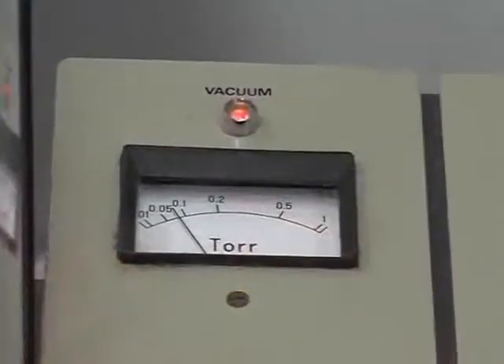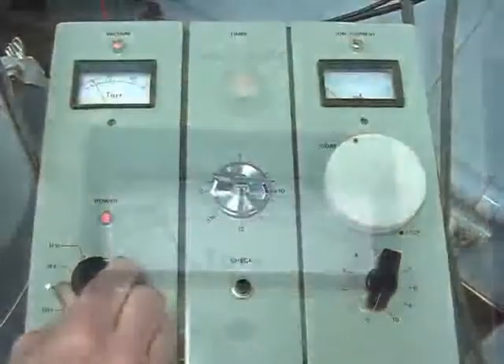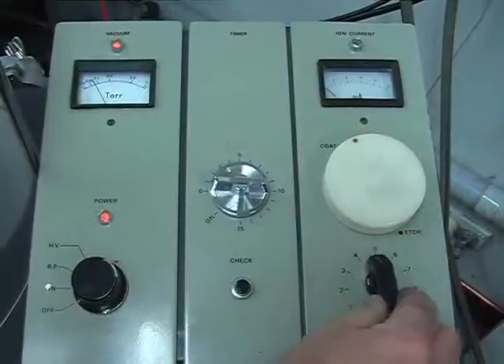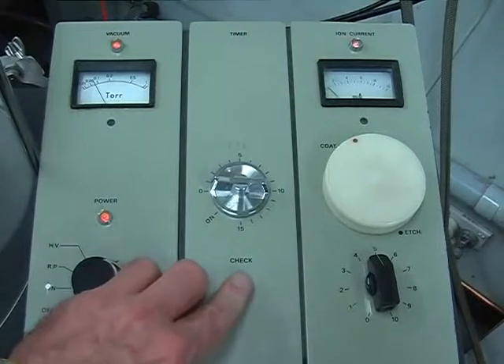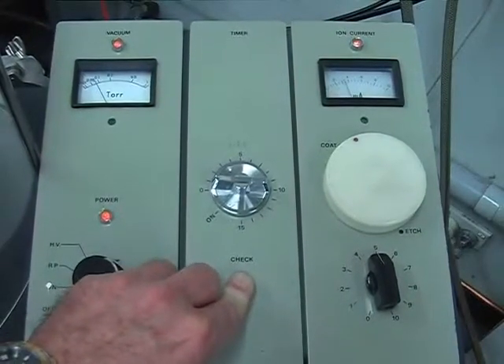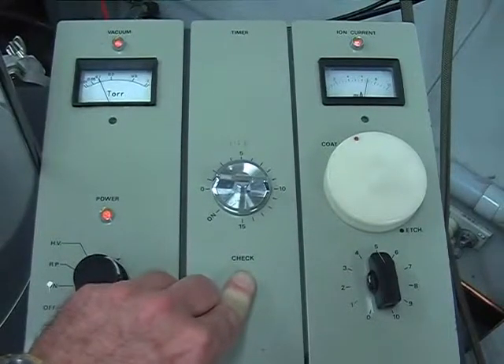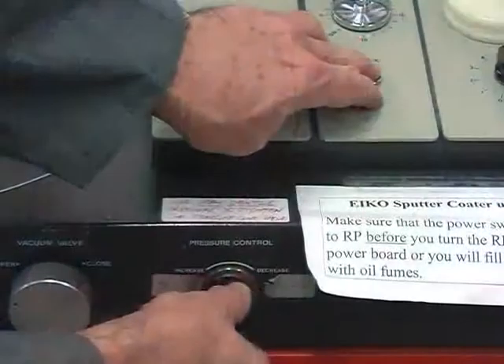Turn the power dial knob to HV, then press the check button in the centre panel and turn the ion current knob to 5. While still holding down the check button, open the argon pressure control needle valve and adjust it so that the ion current reading is stable at about 6 milliamps. Then release the check button.